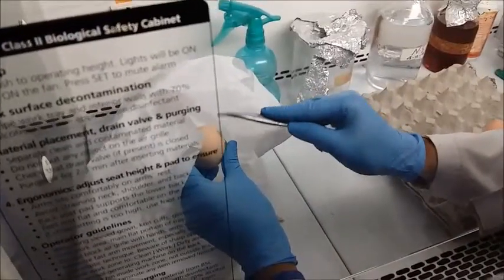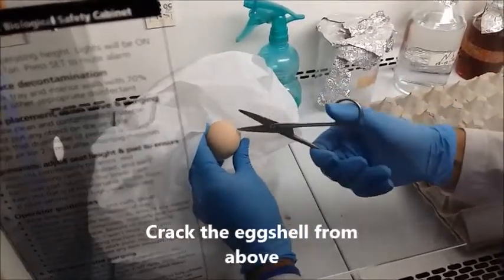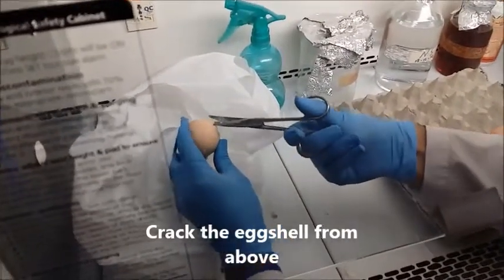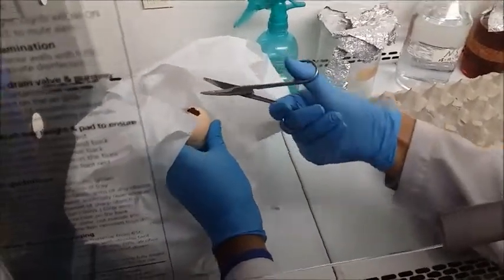The first thing you are supposed to do is crack the egg gently using a scissor or anything else, and then you are supposed to cut a portion of it in a round shape like this.